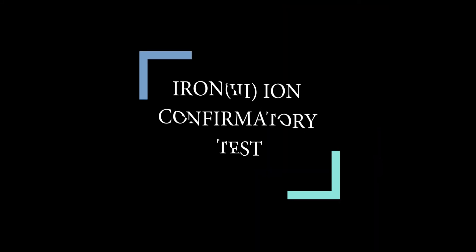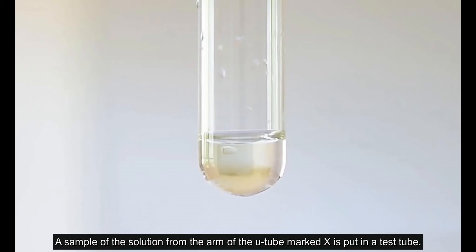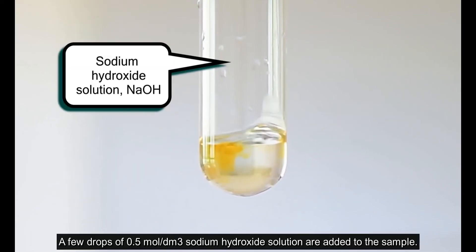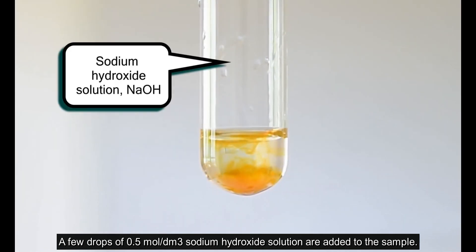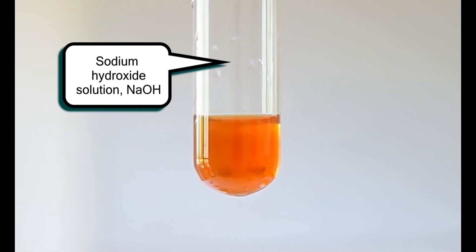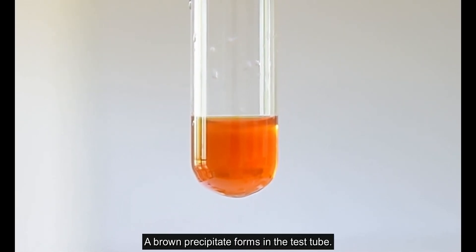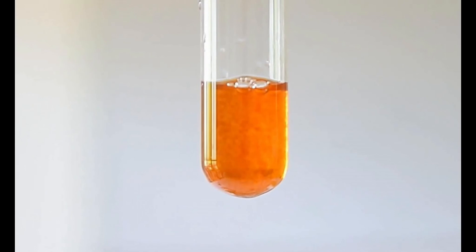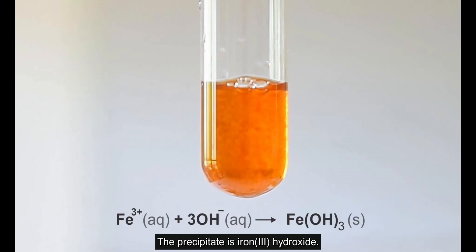A sample of the solution from the arm of the U-tube marked X is taken and put into a test tube. A few drops of 0.5 mol per cubic decimetre sodium hydroxide solution are added to the sample. A brown precipitate forms in the test tube — the precipitate is iron(III) hydroxide.